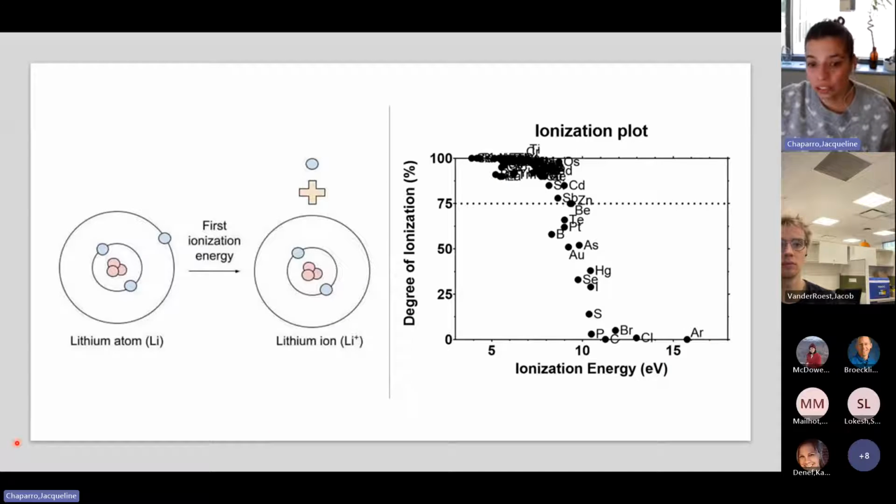ionization energy. And so all the elements require less energy than that of argon to remove an electron. The other nice thing is that this ionization energy is sufficient to ionize, to just take one electron, but it's not high enough to take more than one electron. So we are primarily able to selectively get positively singly charged species instead of doubly charged species, which would affect some of our measurements. So it simplifies what we're looking at.